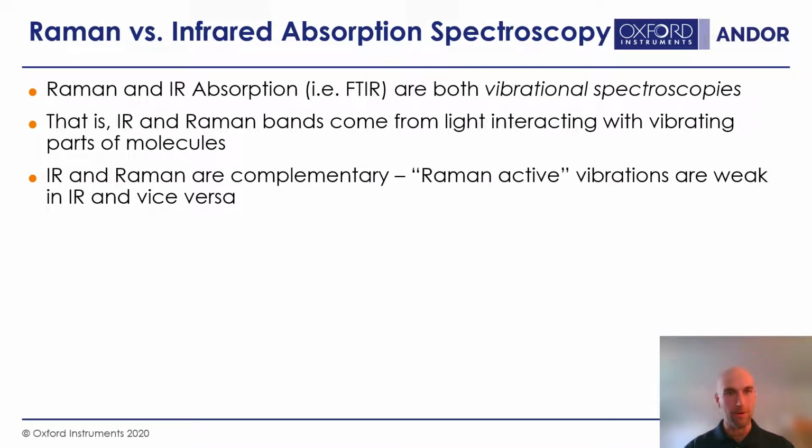Just a quick note about the difference between Raman and infrared absorption. Raman and IR, sometimes typified by FTIR, are both vibrational spectroscopies. That is, IR and Raman bands come from light interacting with vibrating parts of molecules, or vibrations in molecules.